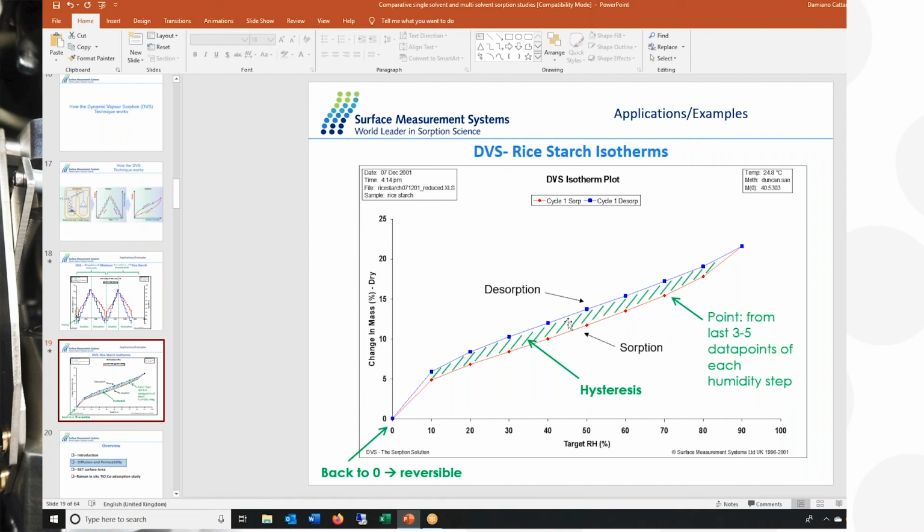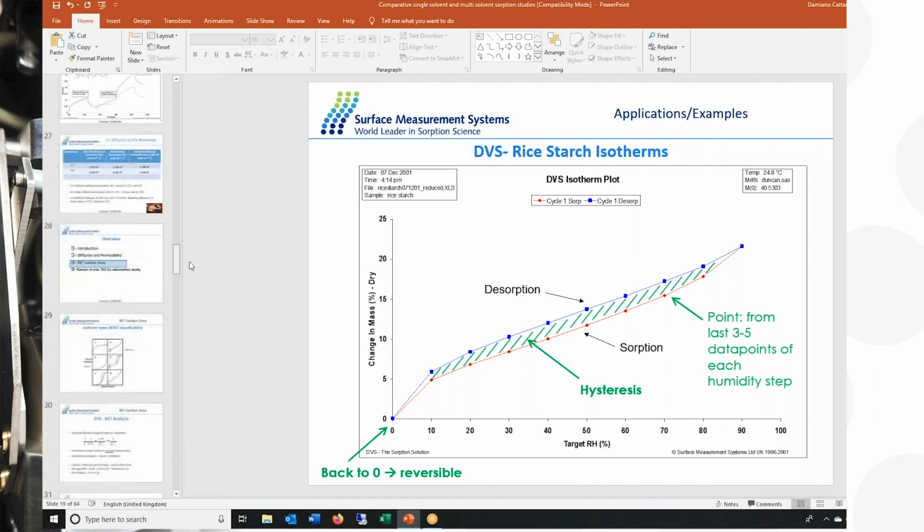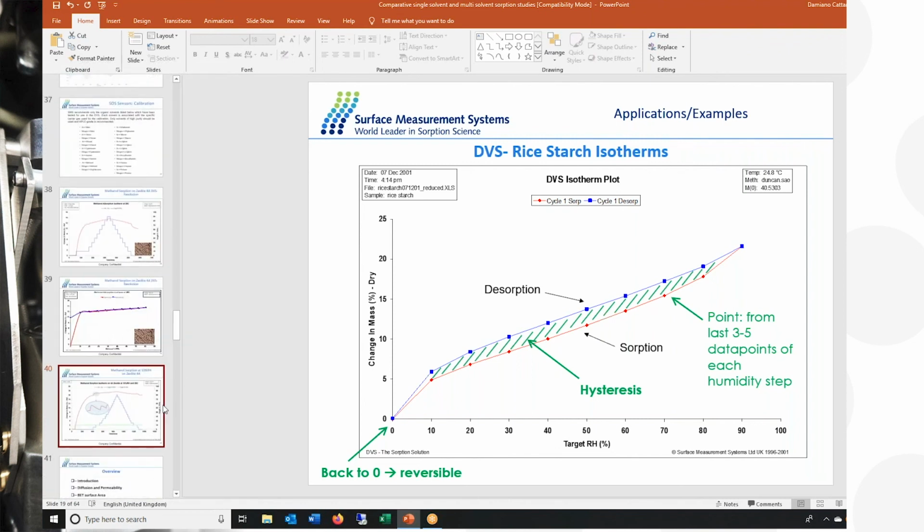Philip said that the example that you gave was an absorption. You can unmute your mic, Philip, if you want to clarify it for Damiano. Can you guys hear me? Yes, we can hear you. Okay, yeah, because the zeolite example that you gave is on the, I call it adsorption, right? But if you have a material where your probe goes into the material, absorption, do you observe the same thing?